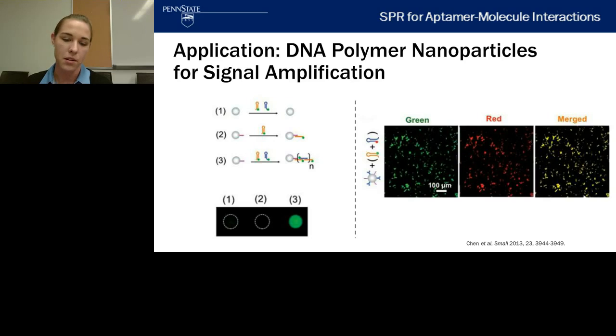In number 2, we can see that the initiator can be bound by monomer 1, but we can't see a large increase in fluorescence in 2 for the fluorescence image at the lower area. However, in 3, we can see that when both monomers, which have a fluorophore conjugated to them, are incubated with the initiator functionalized particle, a large amount of fluorescence intensity can be observed. So this shows that the use of the polymers with the fluorophore attached to each monomer can create a larger fluorescence signal than one fluorophore per reaction site.